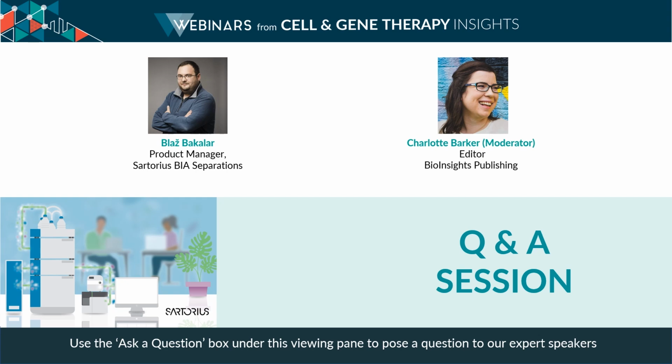Brilliant. And can you monitor if you have multiple RNA species? This is something that we're still implementing in our method because it's of high interest when it comes to, for instance, CRISPR-Cas mRNA therapies, where you have the guide RNA as well as the Cas9 RNA. And this is something that we're looking to do as well, to separate both, to see how much of each is encapsulated in the LNPs.